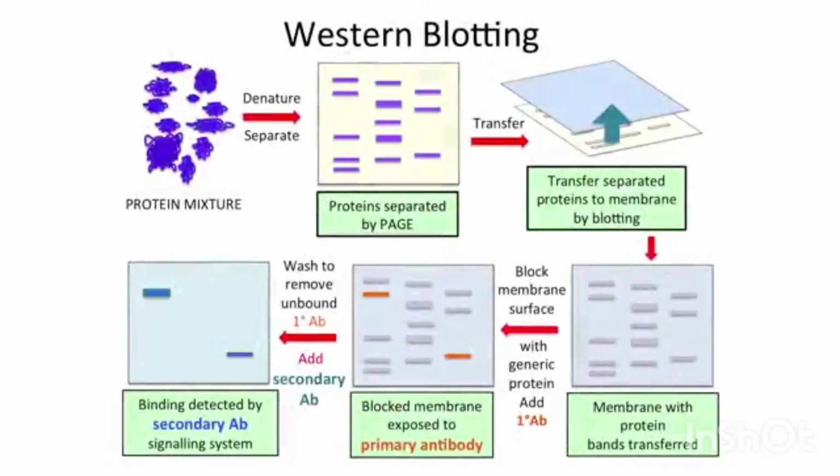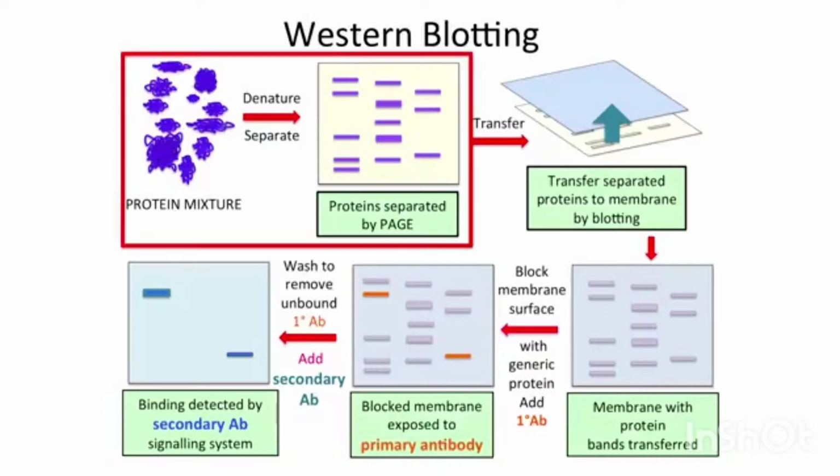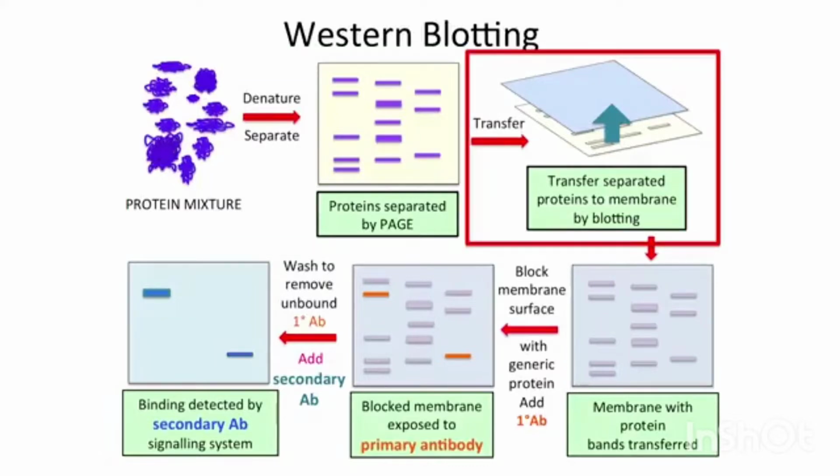It turns out that Western blotting is a way to see specific proteins and to apply the antibodies that we have talked about to SDS gel electrophoresis. So you can separate your protein by polyacrylamide gel electrophoresis, and you'll have the whole family of proteins that are in the mixture with your protein. And then you can transfer the proteins to a membrane. There are membranes that very tightly bind to proteins, and so you can wash the protein through and onto the membrane.